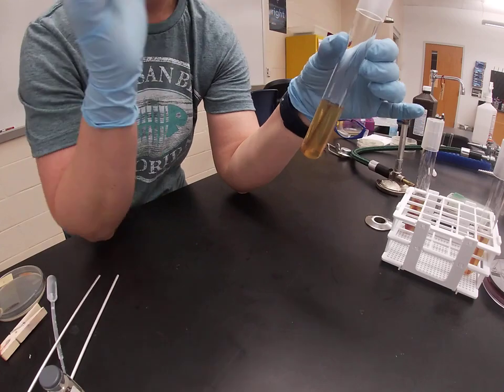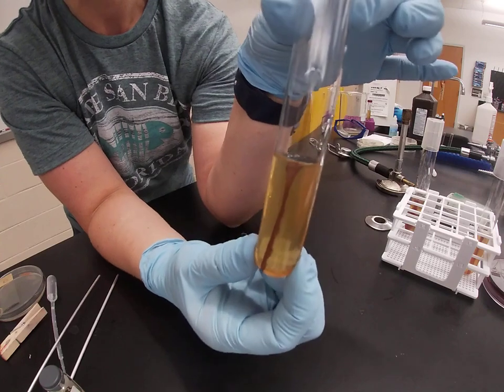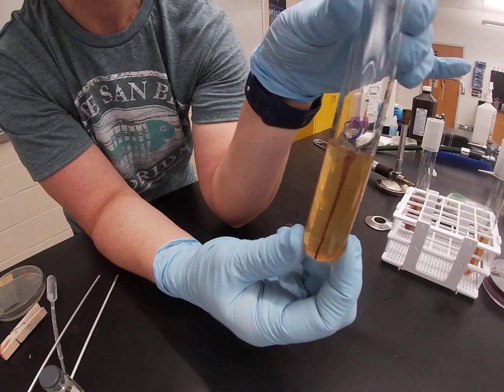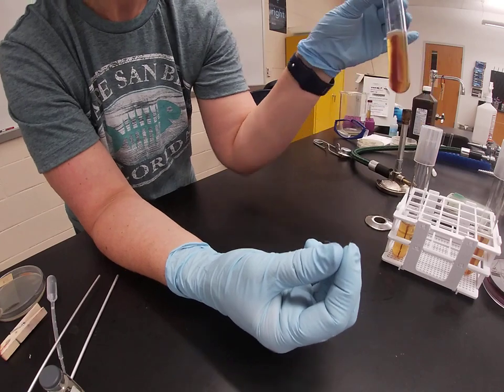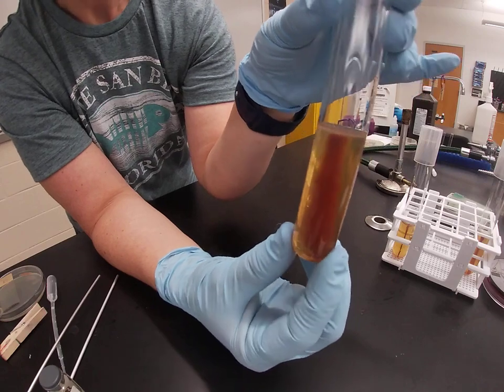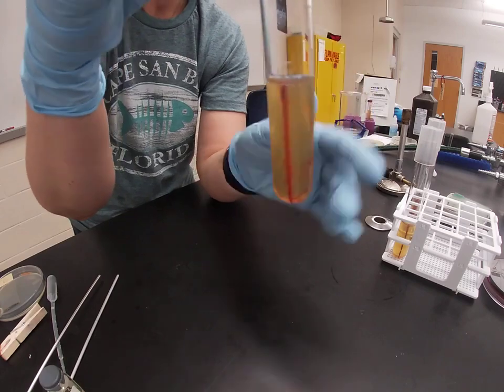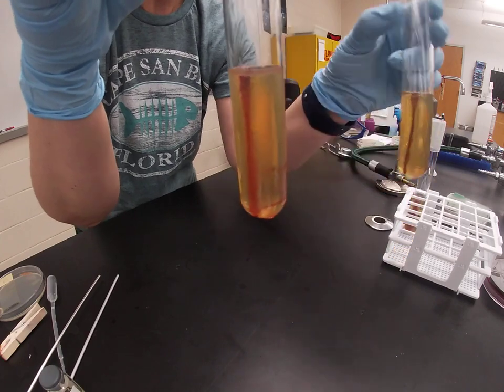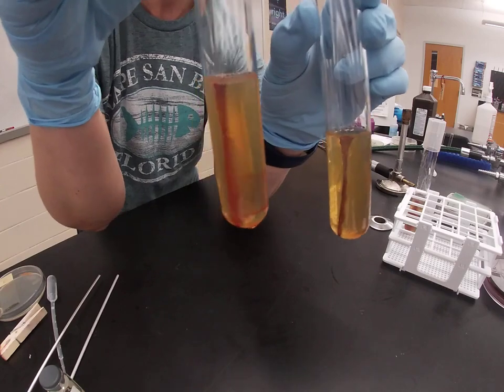So for bacteria that are not motile, they're not able to move, when you grow them in motility agar, they will grow in a solid line. As you can see here, the line is very clean, it's very entire. Organisms that are able to move away from that initial site of inoculation will look fuzzy in their stab. That fuzziness can be pretty thick, like you can see here with this organism, or sometimes it can be kind of thin. But if you can see that haziness around that site of inoculation, that tells you that that organism is motile. You can see a non-motile organism as opposed to one that is slightly motile.